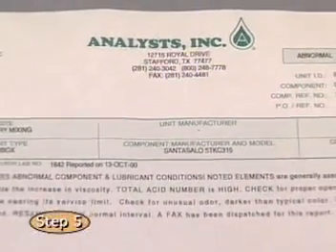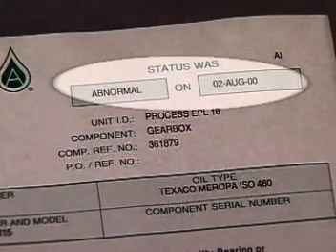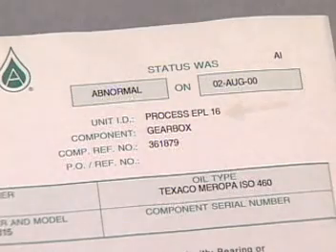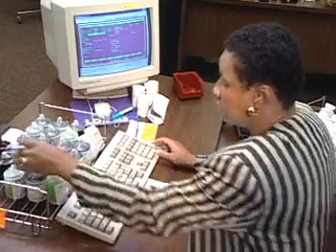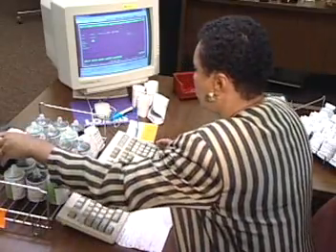The last item in the process is the laboratory report. This report tells you what's happening inside your equipment and what may be done about any developing problem. At the upper right on the report is the equipment status indicated by the analysis — this may be normal, abnormal, or critical. Below the status line are shown the unit ID, equipment component, and the component reference number. If you call about the sample or the report, always refer to the unit ID and the component reference number. At the laboratory, the component reference number links together the sample, equipment, and its analysis, helping you get the information you need.